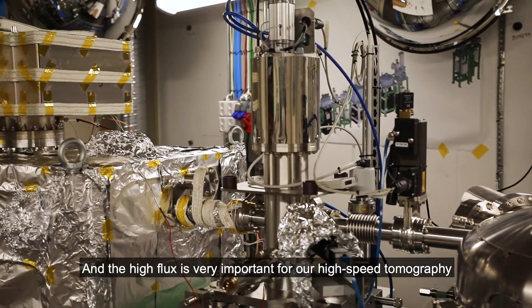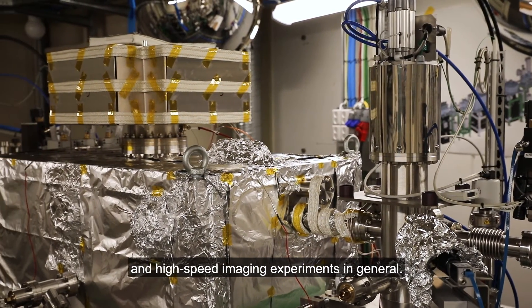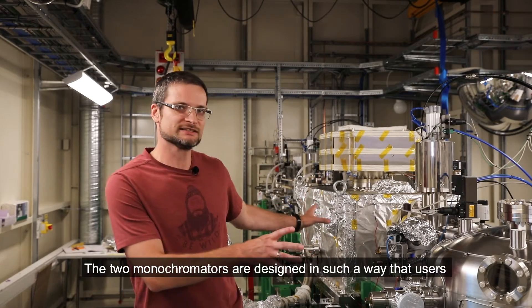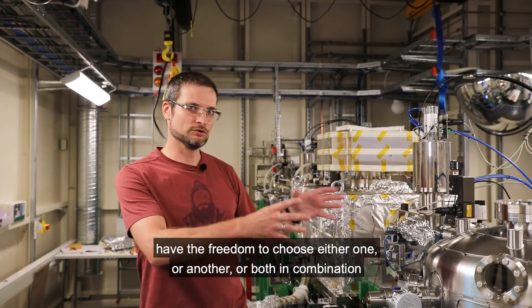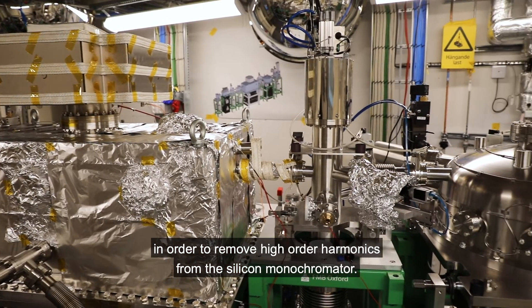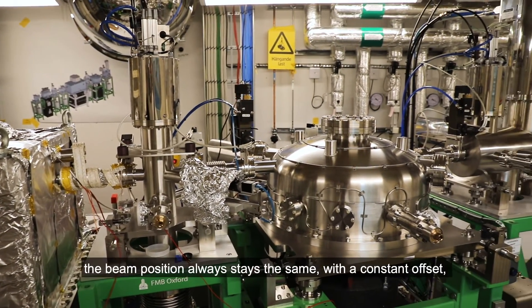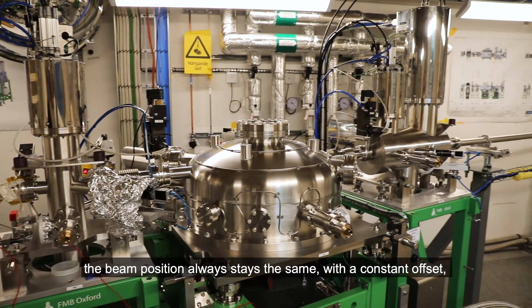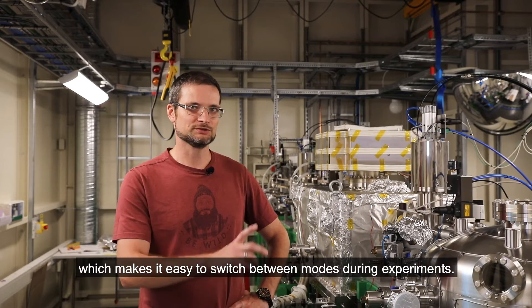The high flux is very important for our high-speed tomography and high-speed imaging experiments in general. The two monochromators are designed in such a way that users have the freedom to choose either one or the other, or both in combination in order to remove higher harmonics from the silicon monochromator. Whatever operation mode users choose, the beam position always stays the same with a constant offset, which makes it easy to switch between modes during an experiment.